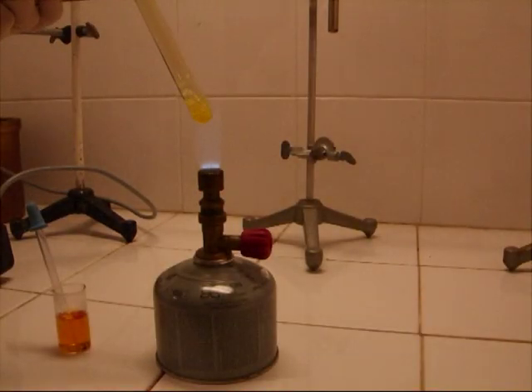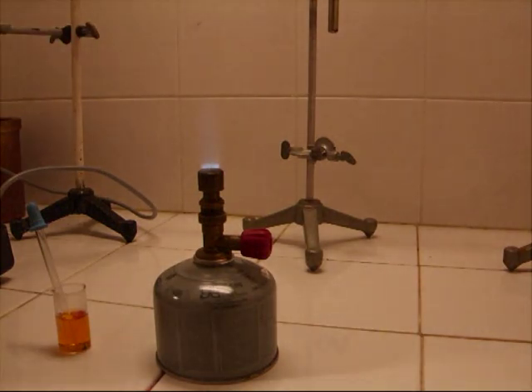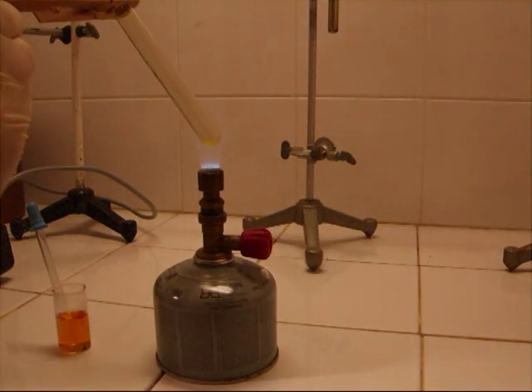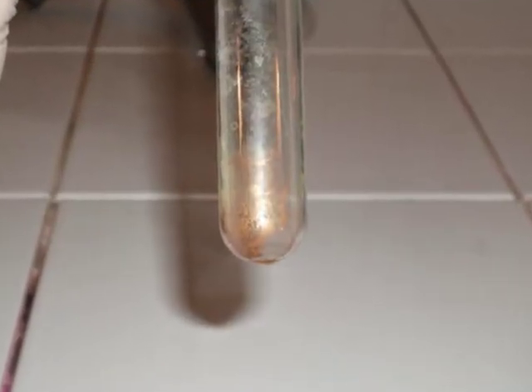Now, to check if there is really gold in the solution, the liquid part of the solution is vaporized. The chloroauric acid settles down on the inside of the glass. By adding more heat, the chloroauric acid decomposes to gold and some chlorine, which also evaporates from the test tube. The rest of the gold stays on the glass, forming a mirror.